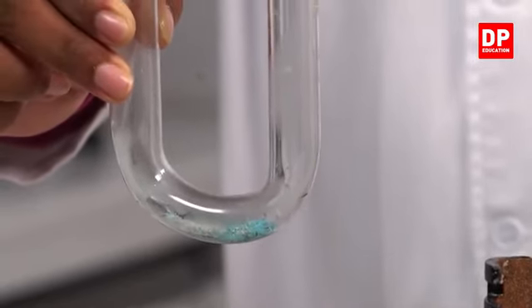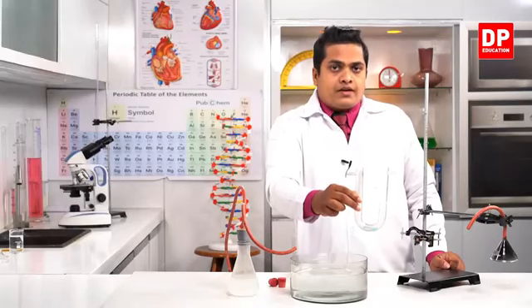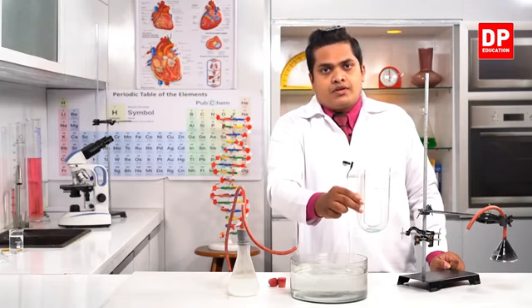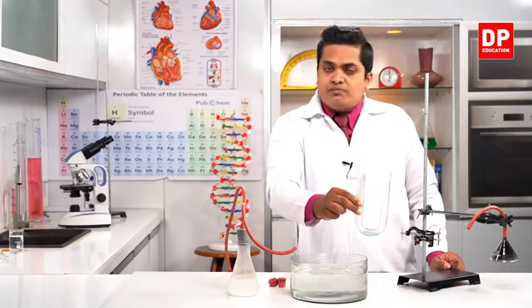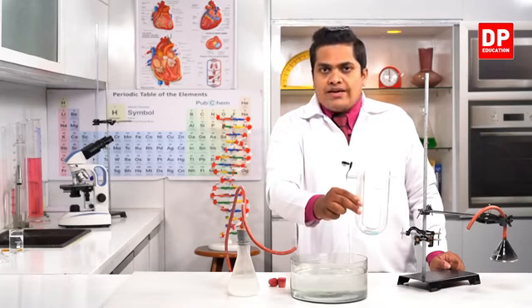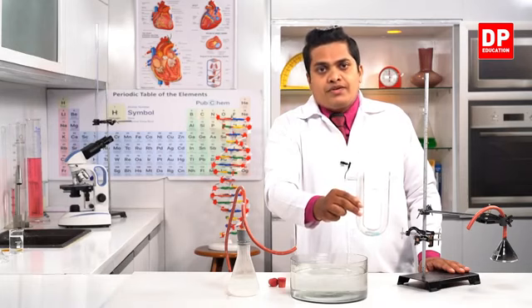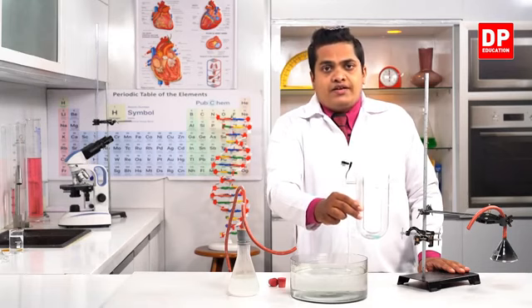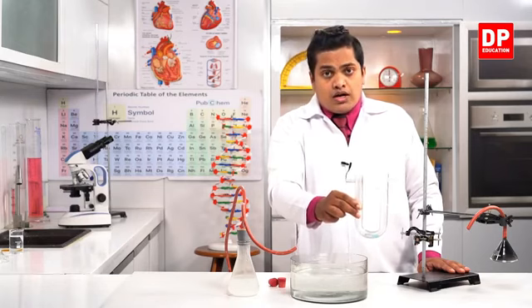So due to that gas which is coming out from the candle containing water vapor, this copper sulfate has changed into blue color once again, right? So from this observation, we can conclude that during the burning of candle wax, water vapor is getting emitted. That's why the anhydrous copper sulfate has changed into a different color, which is the blue color.